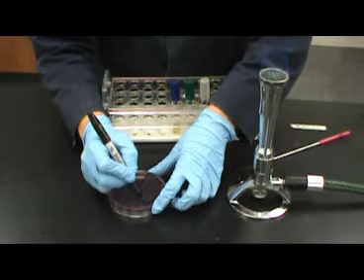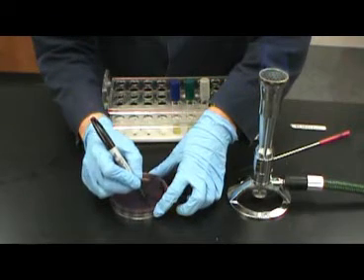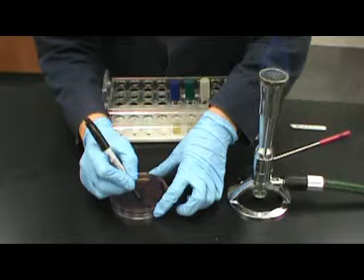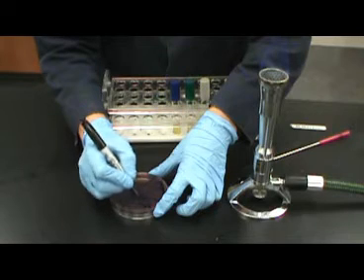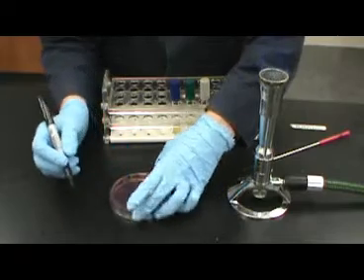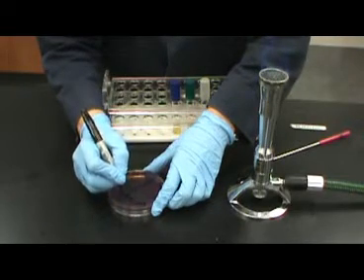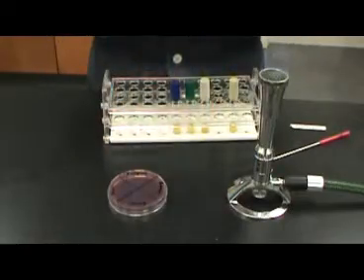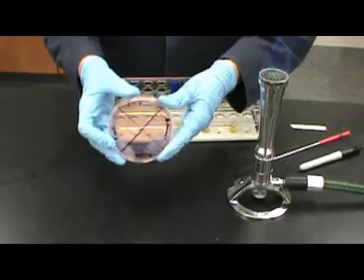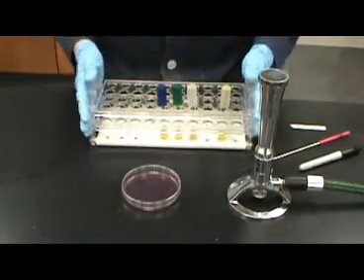MacConkey agar is both selective and differential. Selectivity is against gram-positive organisms and is due to the presence of bile salts and crystal violet in the media. The differential agent in MacConkey agar is lactose. Gram-negative enterics, particularly coliforms, are capable of lactose fermentation. Fermentation will give off acidic waste products which will be detected by the pH indicator neutral red.